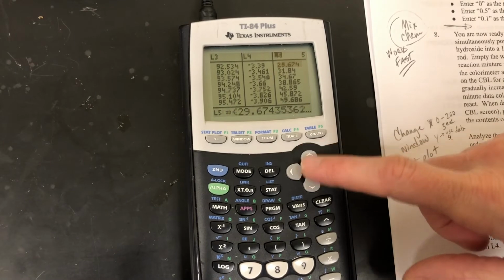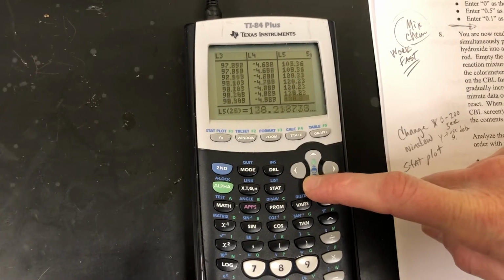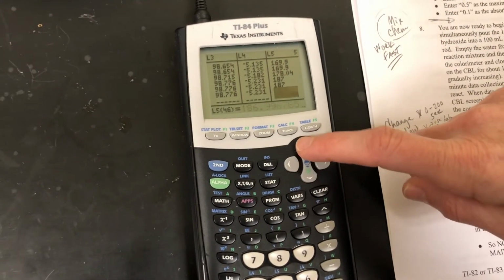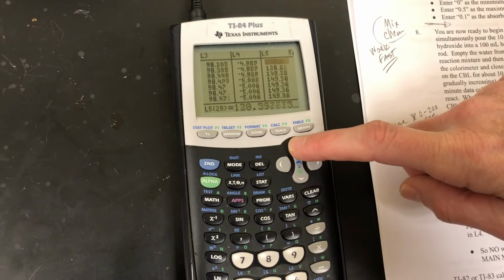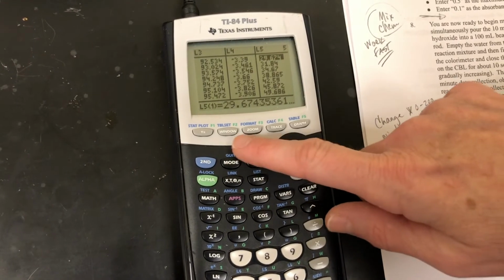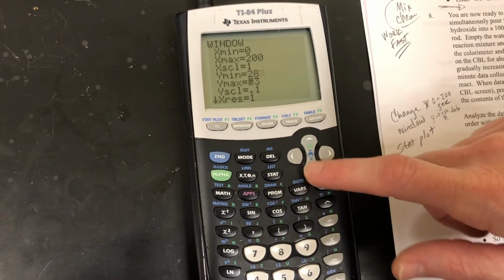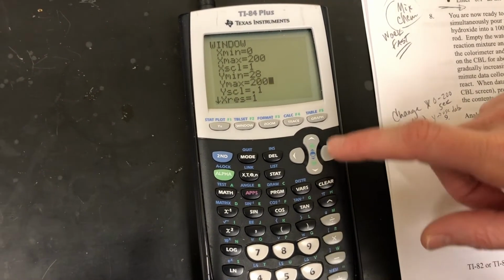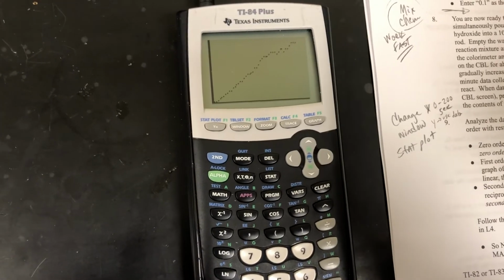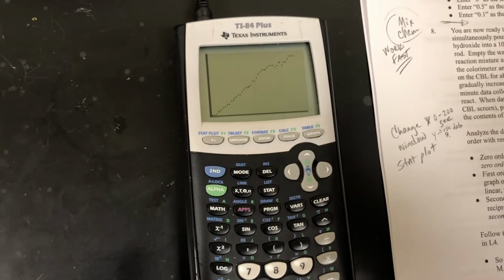So we've got 29 up to 187. So I'm going to go like 28 to 200, and that should cover it for our Y values. Okay, so I'm going to do window. My X is still fine because it's still time. But now I'm going to go 28 is my min, 200 is my max, and then we'll go ahead and graph it. And then this is the data that we get if this reaction is second order with respect to the concentration of crystal violet.